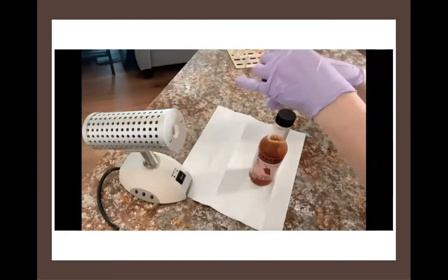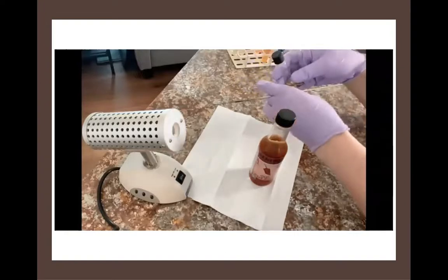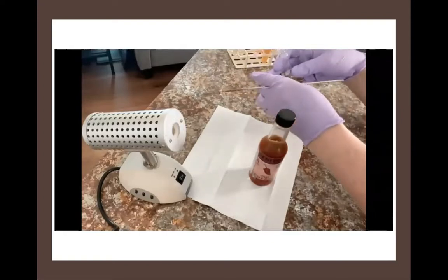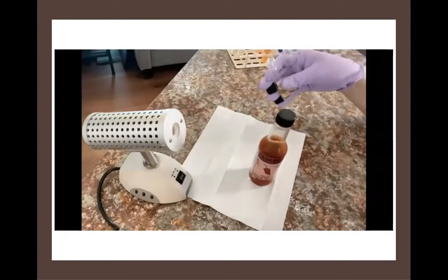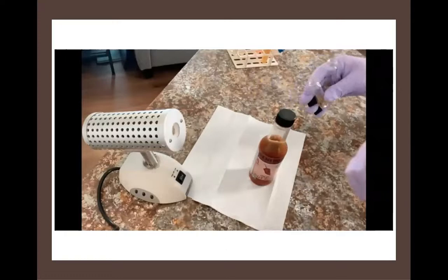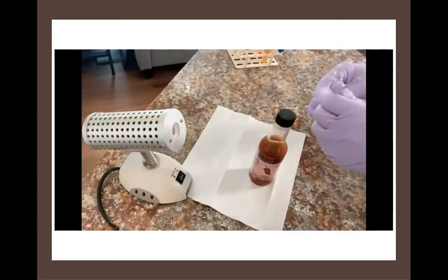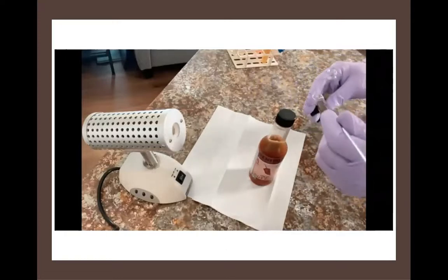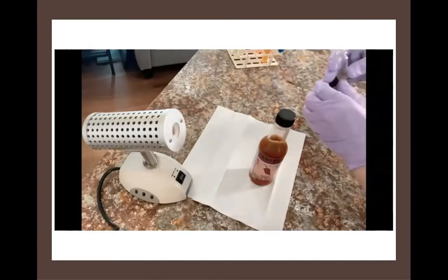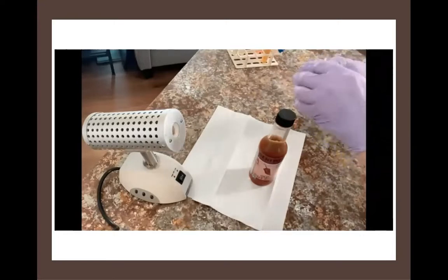I've got my tubes at an angle. I'm going to take off both caps. And the reason I do that is because I'm going to be flaming. So I'm going to flame the culture tube first. Now I'm going to take out a sample from the culture tube. I'm going to flame it again. And now I'm ready to close the culture tube.